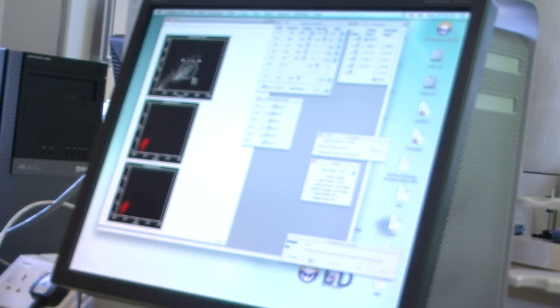Whereas I've also used HaCaT cells, a keratinocyte cell line. Now, normally when you trypsinise cells, you wash the cells off, you put your trypsin in, you wait for a minute, you tap your flask, they're all coming off, you add your media to neutralise and so on. HaCaT cells, you take off the media, you put on some PBS EDTA and wash them, and do that again. Then put your trypsin on, put them in the incubator for 15 minutes, take them out, they're not coming off yet. So you take off your trypsin, you put fresh trypsin on, you then put it back in the incubator for another 10 minutes, and then you get your flask out and you go bang, bang, bang, bang, bang on the desk, and they start to come off.